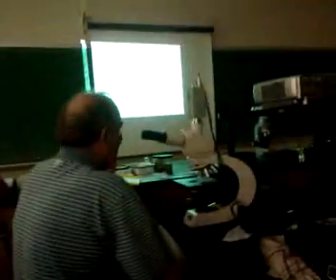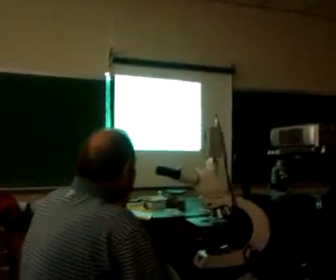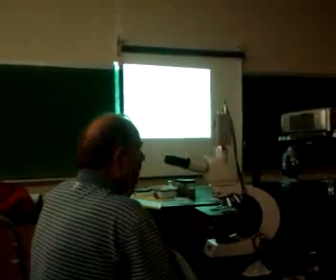So I might put the pointer right there. I might say, identify this area, or I'll word it so that you'll know that you're supposed to pick it out. But remember, this will be multiple choice, and that's going to make it easier. And so that's going to be the alveoli.